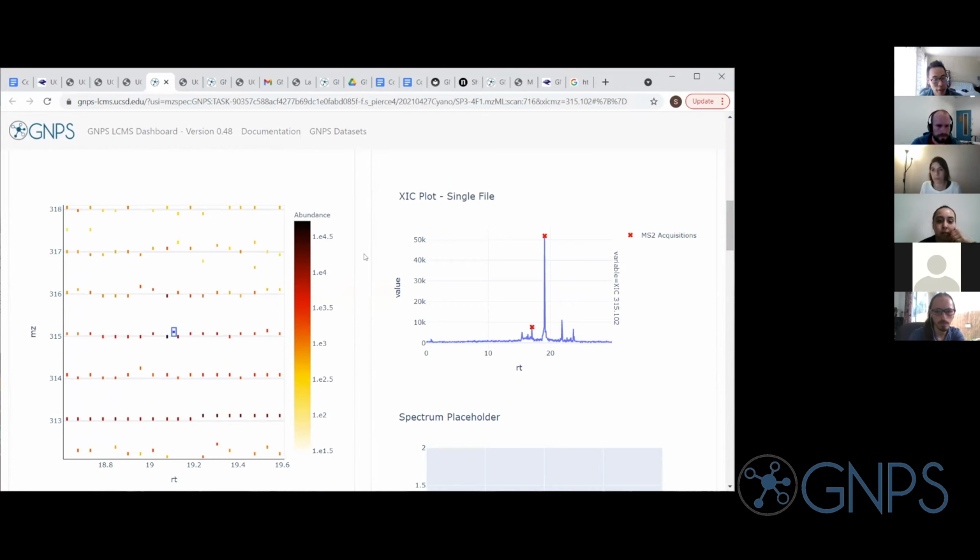So we're zoomed in. What you can start doing is move your mouse over the heat map and go to the very top, in the middle next to the home button. You can zoom out, or you can use the home button. Either one will work. Reset axes. So you click that.